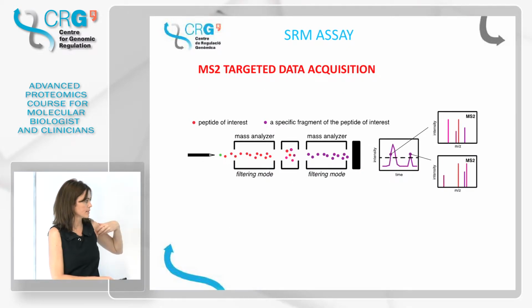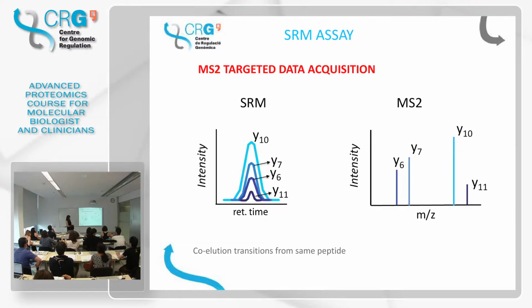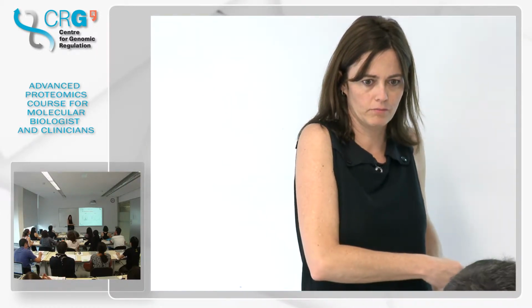When we have this, it means that each one of these signals belongs to a different peptide, because if not, they would be coeluting. The intensity reflects the abundance or the size of the fragments? The abundance, that intensity, yeah. Remember, the fact that this is more intense than this is just because this fragment gives you a higher intensity. Because it's more present.